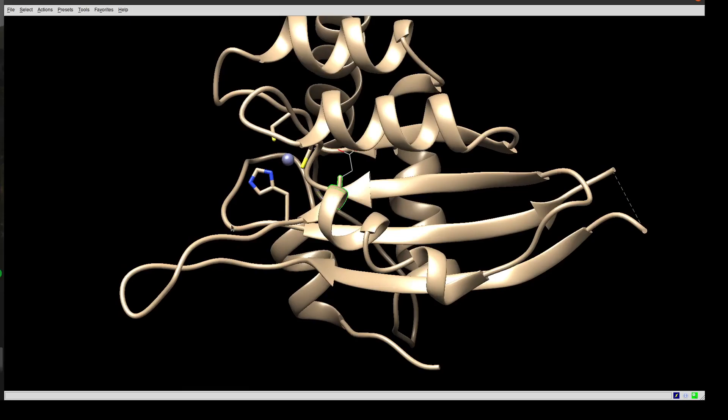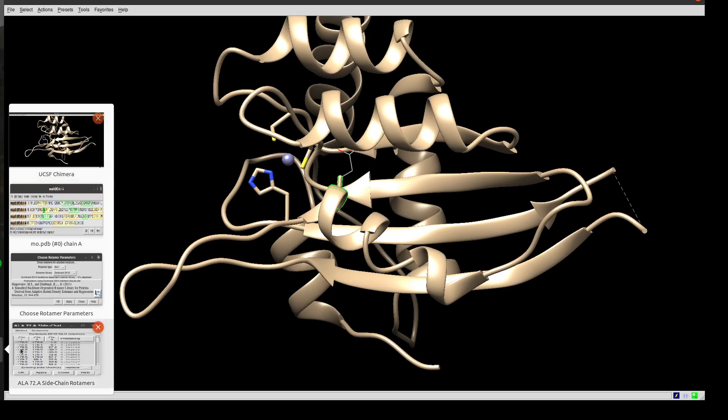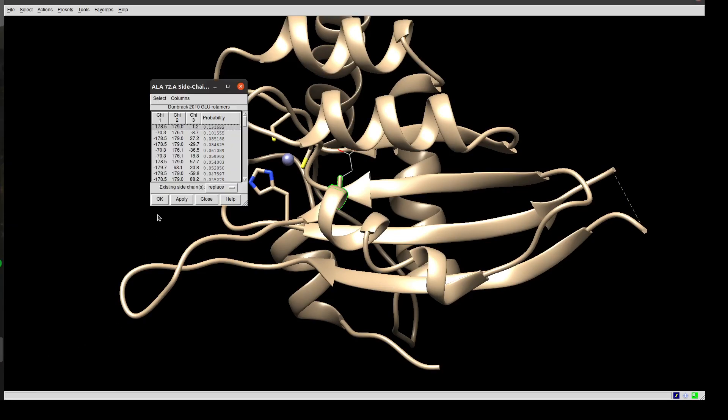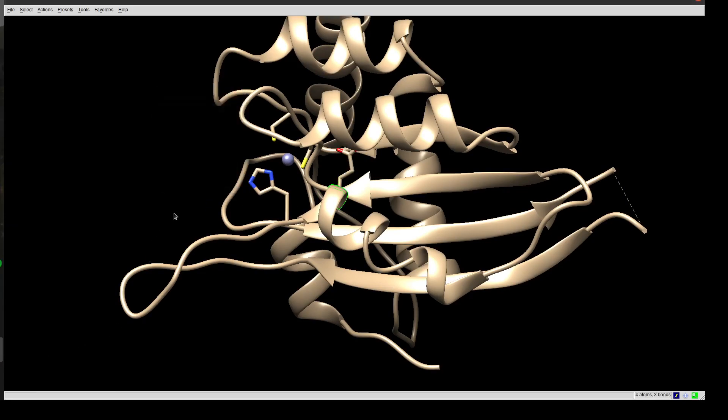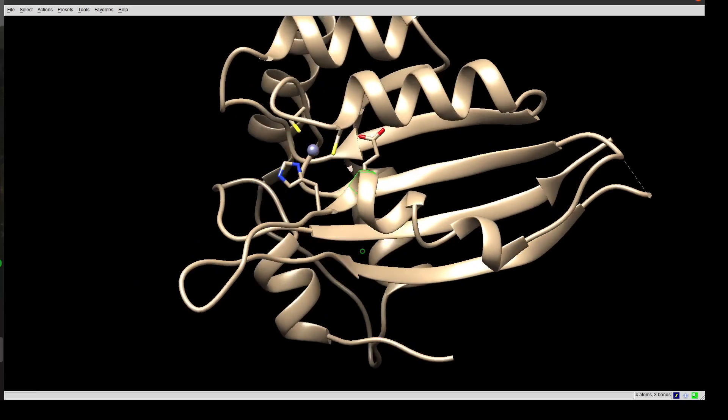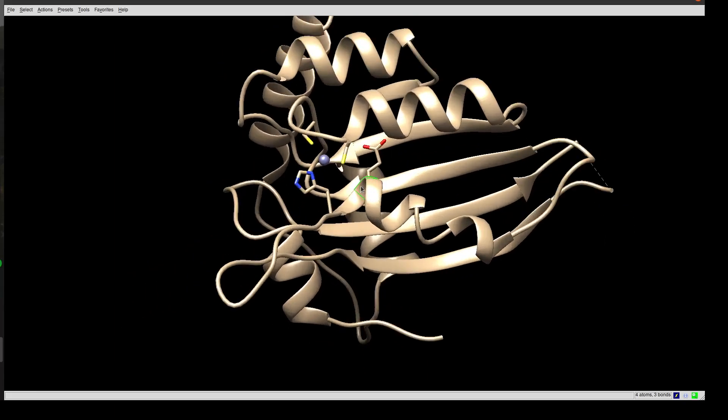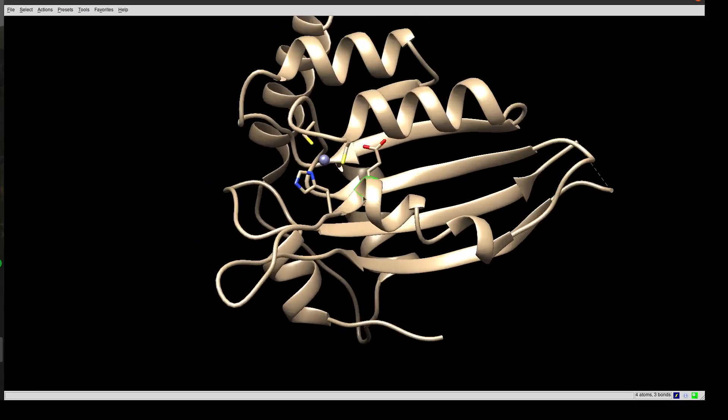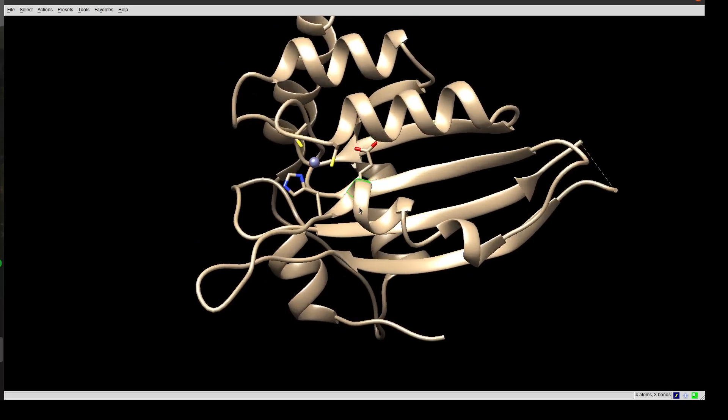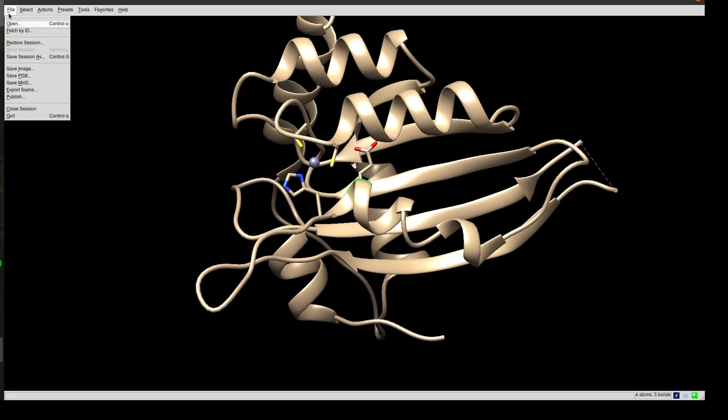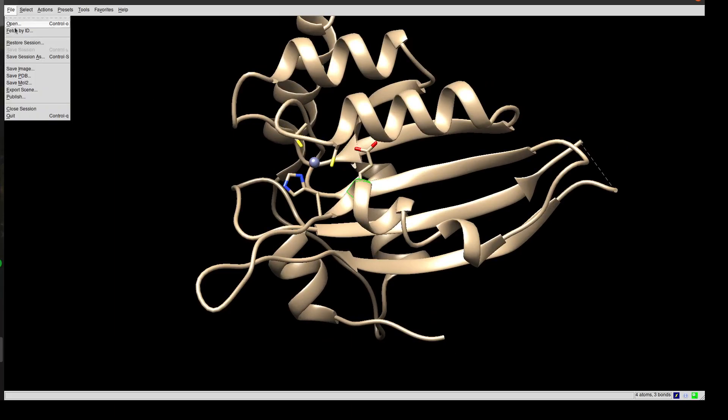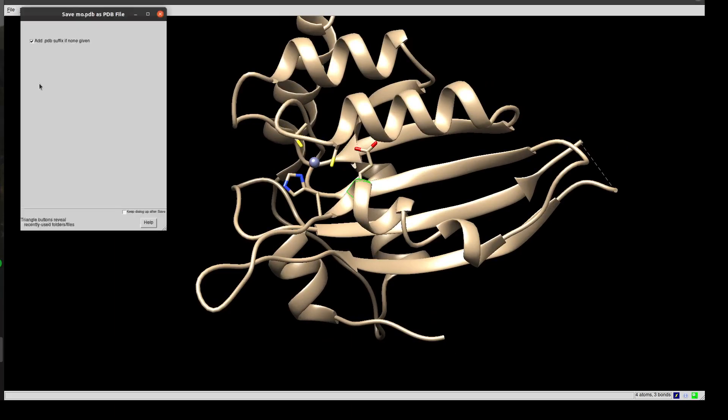Now we have the side chain of Glu, not Ala. I'll go to File and Save PDB, and we're going to call it 'mute.pdb'. Let's make sure that we mutated. Never trust the computer.